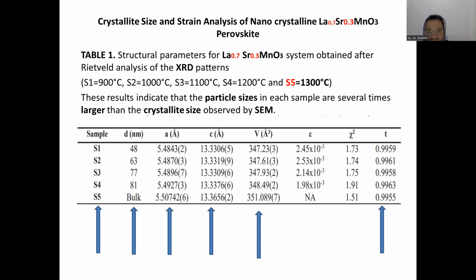It's a huge difference between the particle size here and the crystalline size observed by using the scanning electron microscopy method.